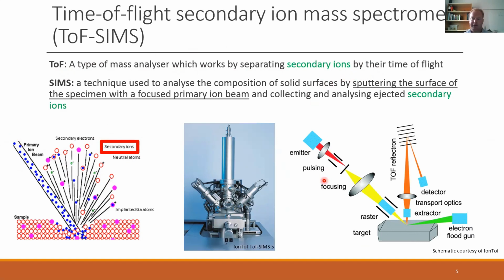This is a fairly mature technique as well as a standalone instrument, and there are a number of manufacturers making ToF-SIMS instruments, and they're largely used in organic analysis and surface analysis.